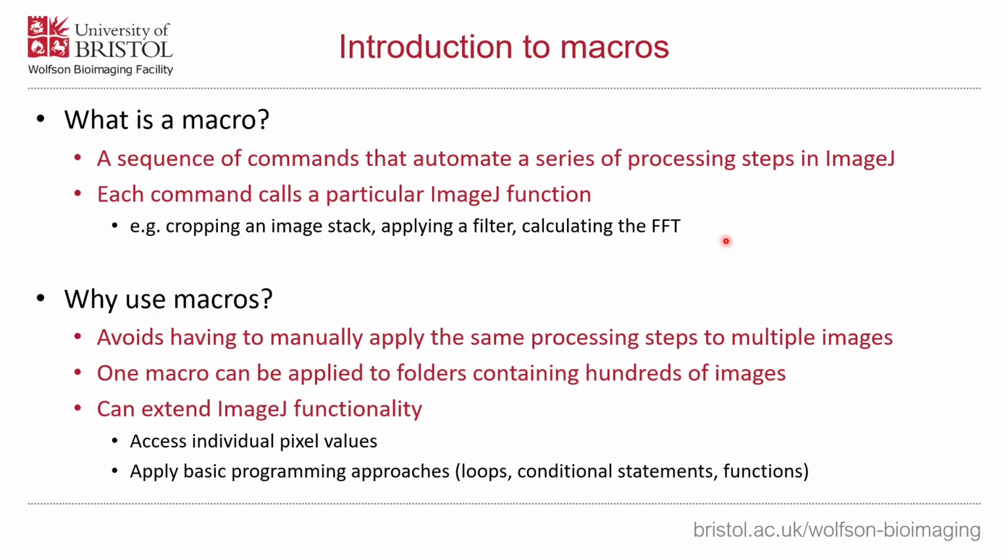The reason that you would want to use a macro is simply that even if you know exactly what you're going to do, like you've got a very well-defined workflow, it's still going to take you a while to click through: load your image, apply this filter, apply a threshold, run the analyze particles. And maybe that takes you 5 seconds and you think that's okay. But that's okay until you've got 20,000 images from some high content system, at which point you would really like to be able to say, well, these are the steps I want to use, and can you just apply that to all 20,000 of these images in a particular folder? And that's where you would use a macro.